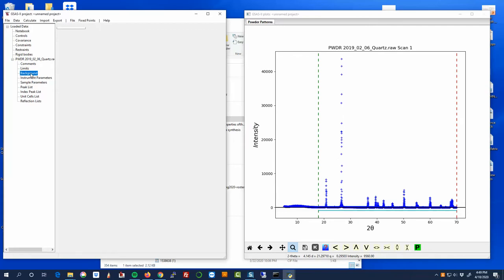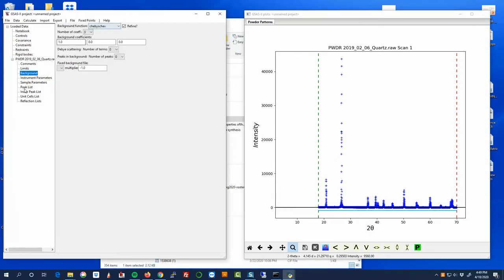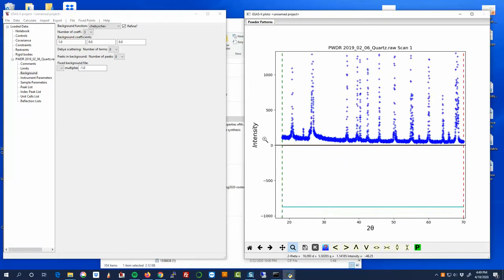So each of these things basically are describing some aspect of the overall dataset. Background is basically just how much intensity we expect to see when we're not on a peak. And so the very first thing that we want to refine is that, but I am remembering now that I haven't done another very important part, which is to bring in a phase.